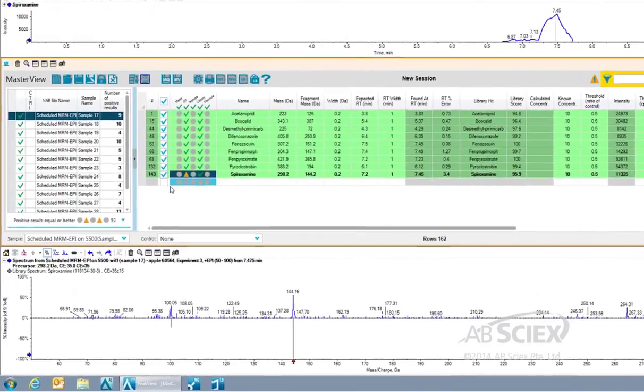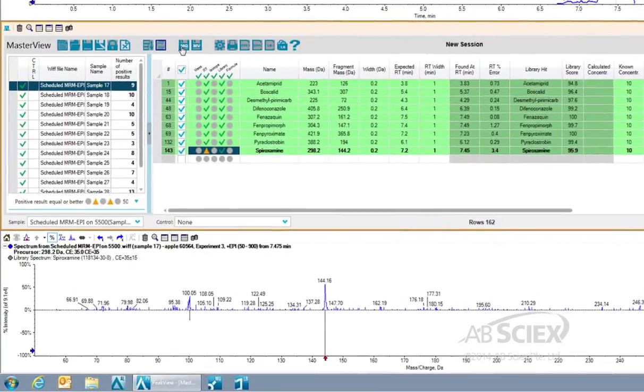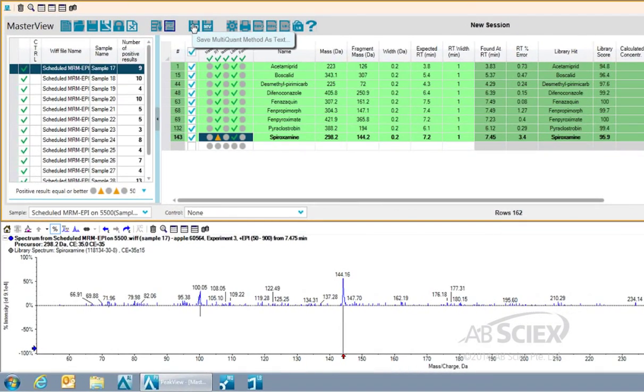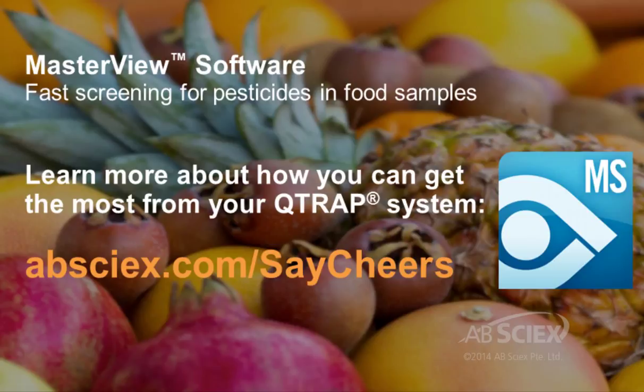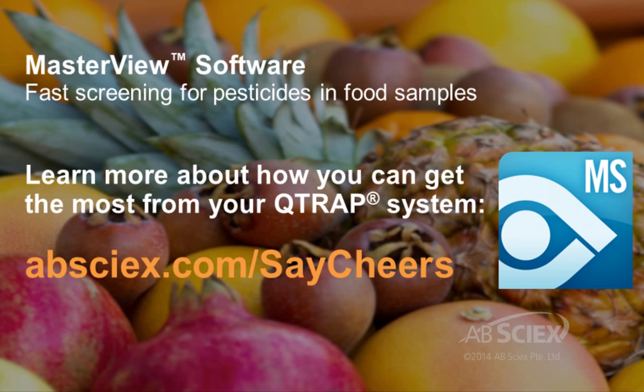Finally, we can either select the MultiQuant button to perform quantitative analysis if needed, or we could directly generate a report of the library search results with one click.